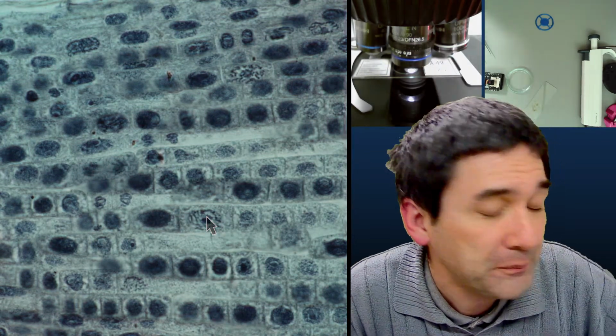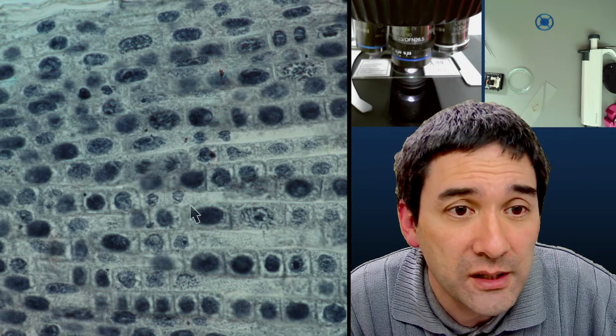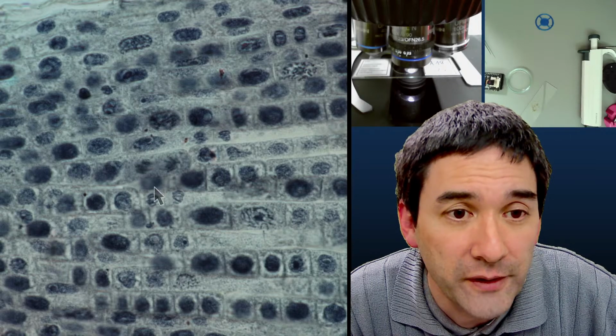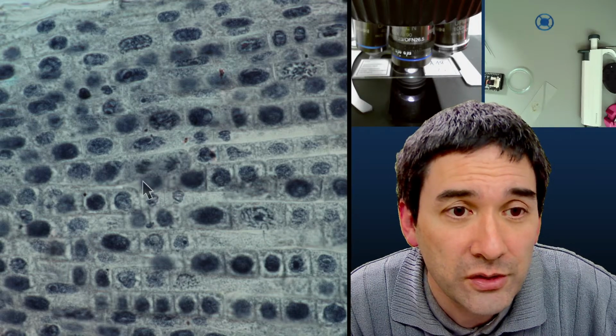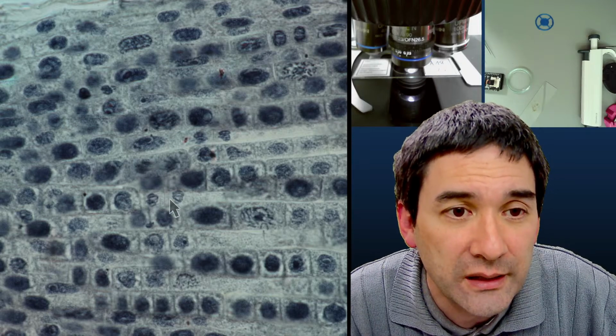But there are, for example, these chromosomes that you see here, those little lines. This cell is in telophase. So it's just divided, and the chromosomes will start to form loose DNA again.